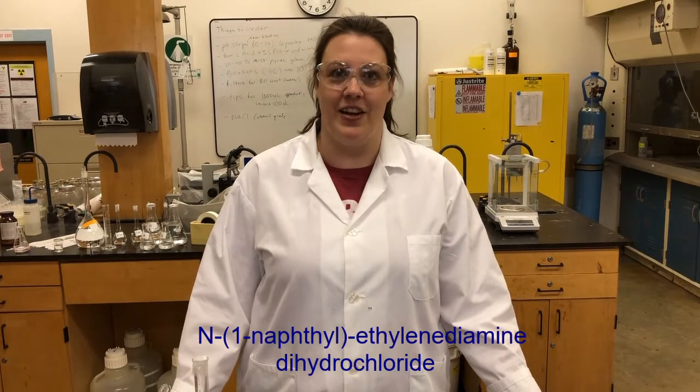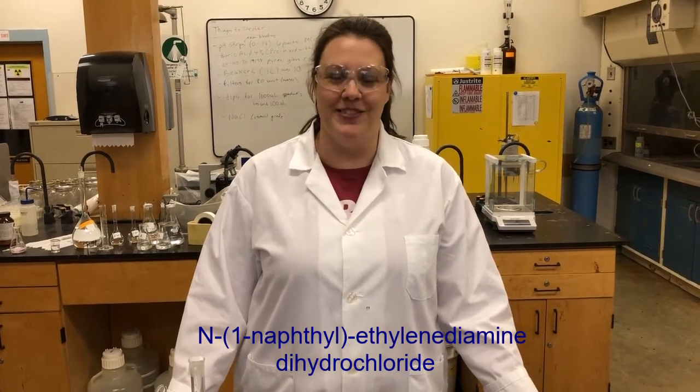And then the second part, we add the NED reagent, which is naphthyl ethyl diamine dihydrochloride, which is a mouthful, which is why we like to call it NED. When it reacts with the NED, it forms a colored azo dye compound, which we can measure on the spectrophotometer. So we're going to start with our calibration curve, and then we'll move on to measuring some samples.